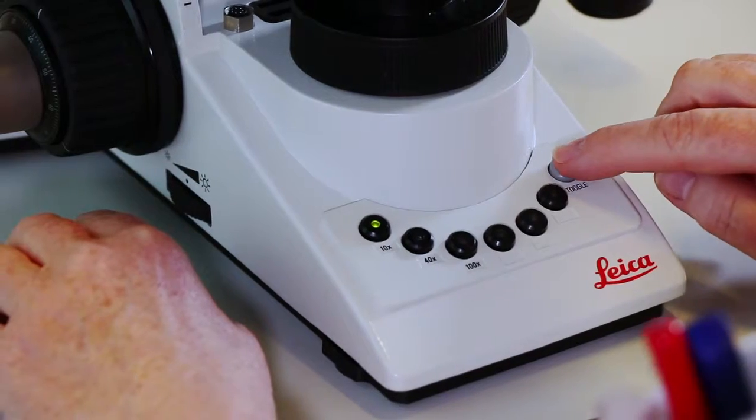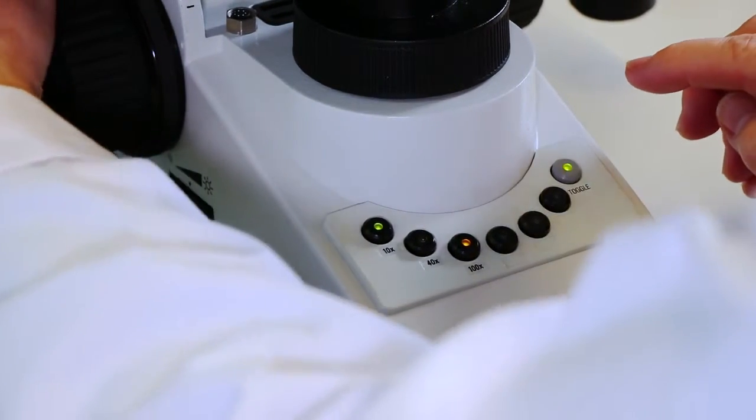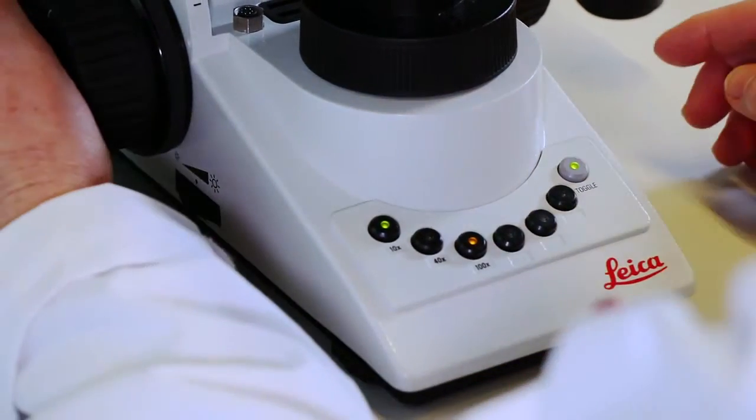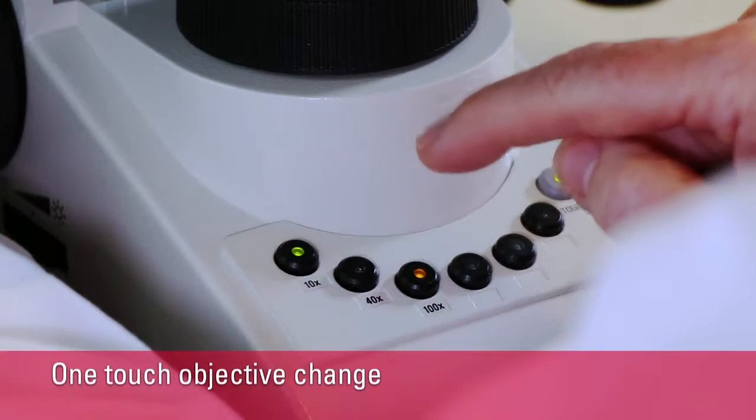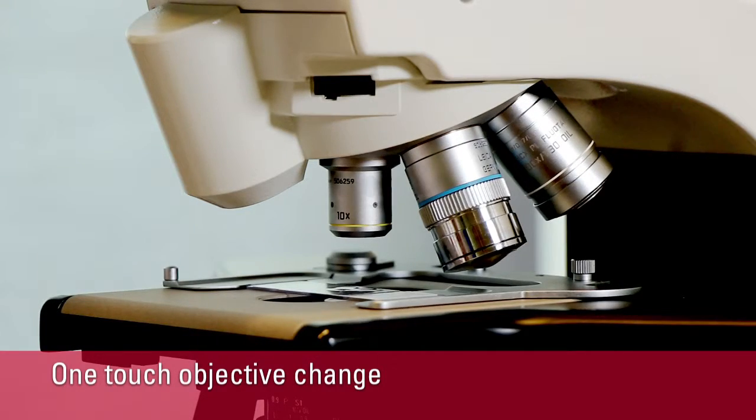I can also use the toggle mode. Then I press the grey button and choose the two objectives I want to use, for instance the 10 and 100 times. So I can change objectives very quickly.